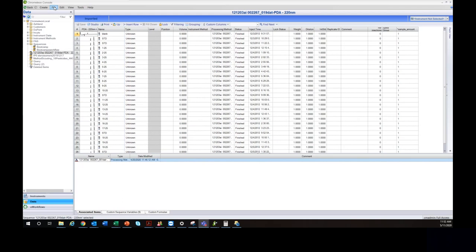For those familiar with Agilent software, a key difference is there's no online or offline mode with Chromeleon — everything is done within the console or studio. Another big difference: when you launch a sequence in Chromeleon, you can actually close the studio and the console. The data will still acquire, and you've freed up an additional user license.